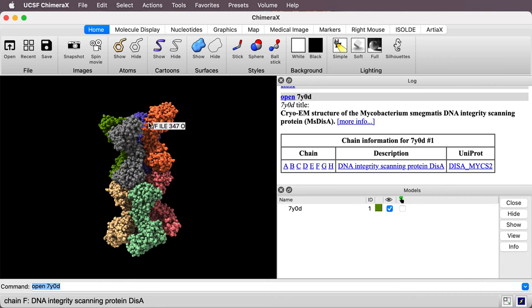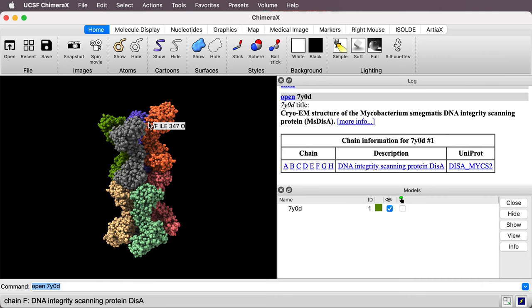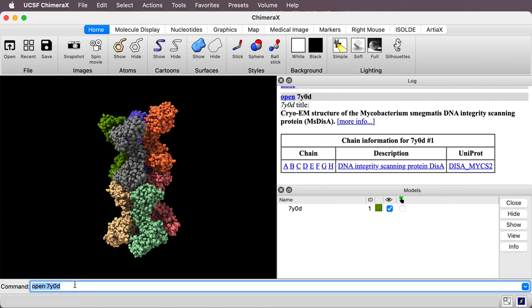The first thing I want to do is align the eight copies. First I'll separate them so that each one is a separate model in ChimeraX. Right now they're all part of one model. So I'll say split number one. Number one is the ID number of the model.